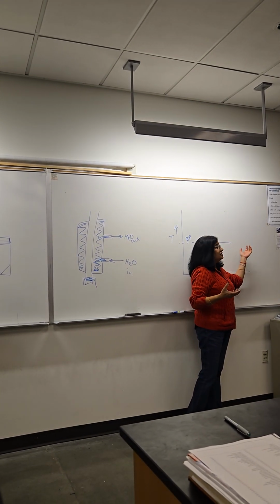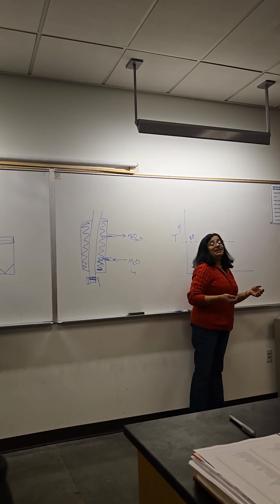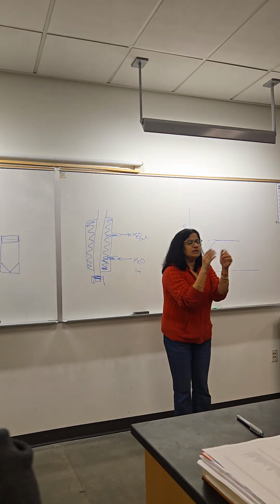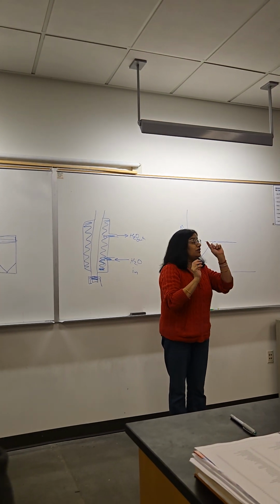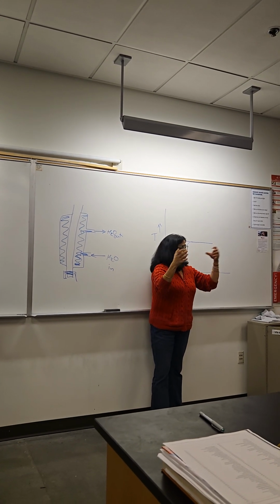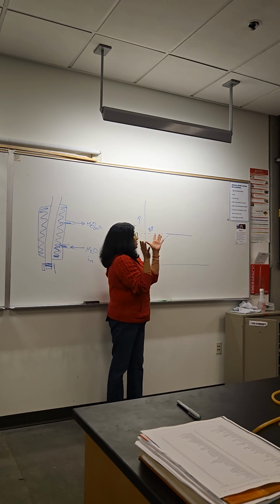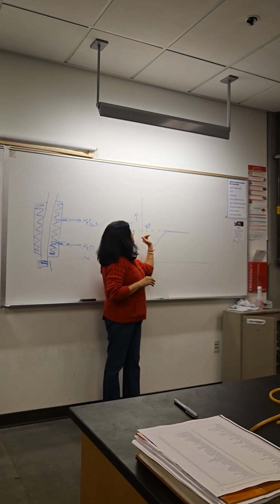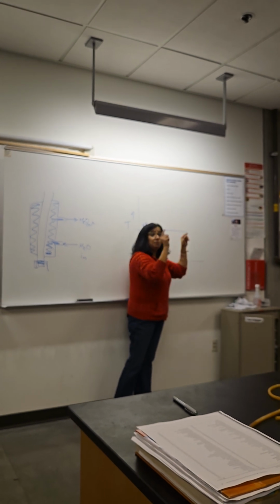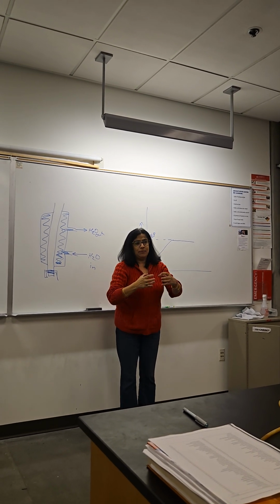The added energy is becoming latent heat, the heat that is needed to overcome those intermolecular forces. So it's not increasing temperature, that extra energy is being used to get rid of those intermolecular forces. So ideally speaking, if everything goes exactly how we want it to go, you might come across a certain point where the temperature doesn't change, but liquid is collecting, meaning condensation is happening.